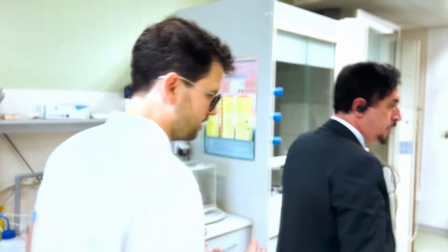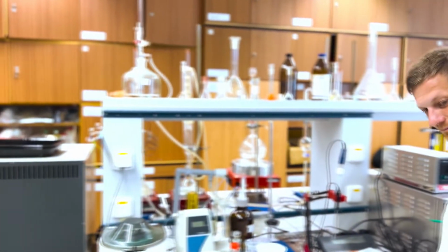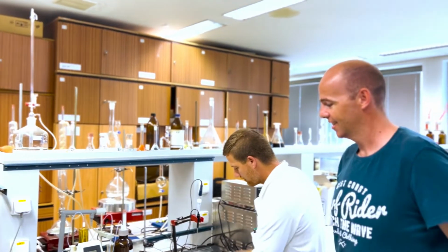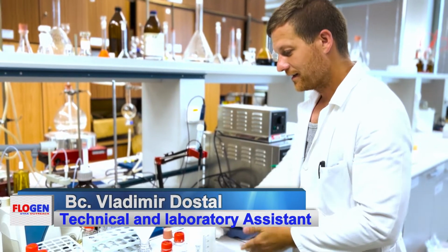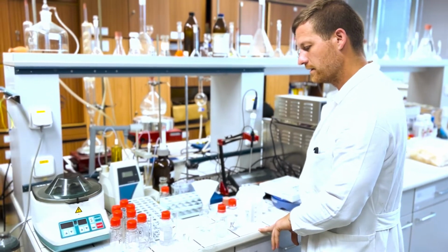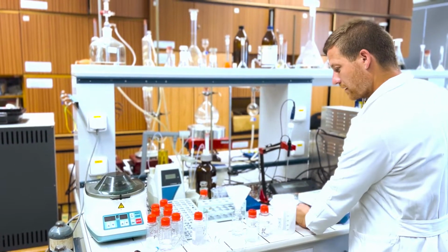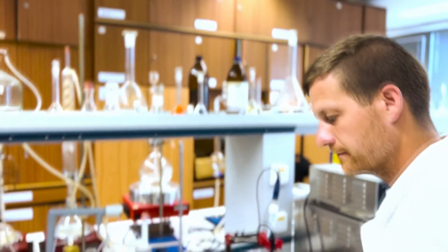Yes. This is the lab part where we start at small scale. So, what are we doing here? I received some samples, then I am now filtering them and I will do some analysis. Filtering to remove what? Remove some solid particles. Oh, there are solid particles. These are samples of what?